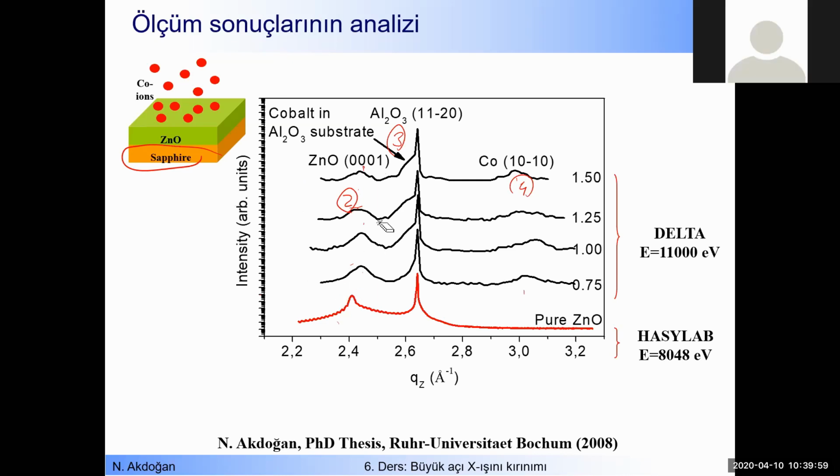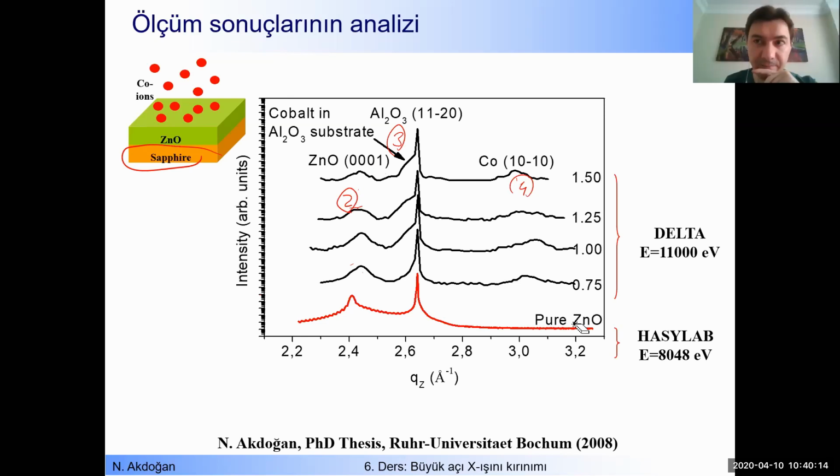Do we have any question, Mergim? Yes, I have a question. If a cobalt atom replaces the zinc atom, it will occupy less space compared to zinc, right? Yes. And shouldn't the distance between them be increased? I can't understand how the D decreased because of the substitution.